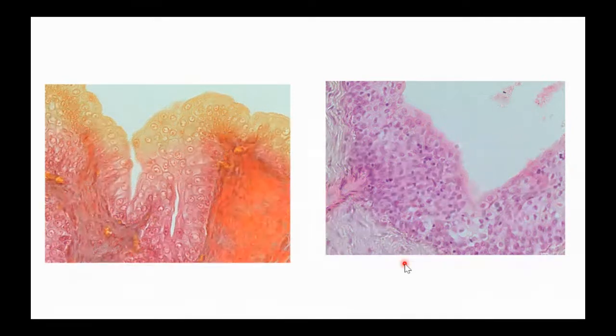So when you look at transitional epithelium, my best hint for you is if you see stuff that's all kinds of shapes and you can't find one shape that seems like it's mainly what you got, you're probably looking at transitional epithelium. I had another colleague though that one of the ways she described it is this kind of tissue kind of looks like a cloud.